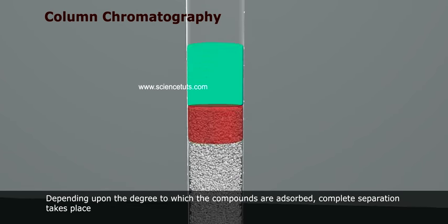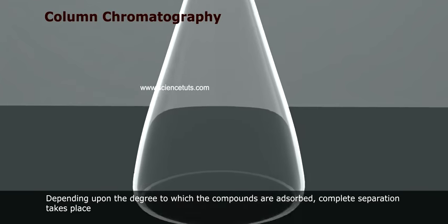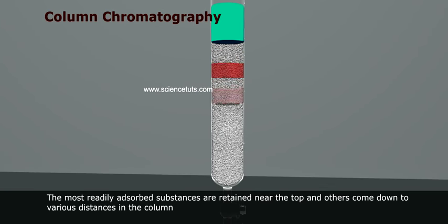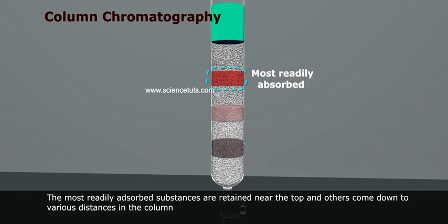Depending upon the degree to which the compounds are adsorbed, complete separation takes place. The most readily adsorbed substances are retained near the top and others come down to various distances in the column.